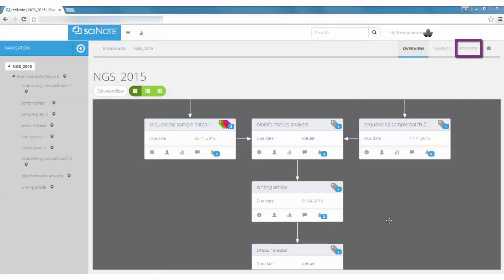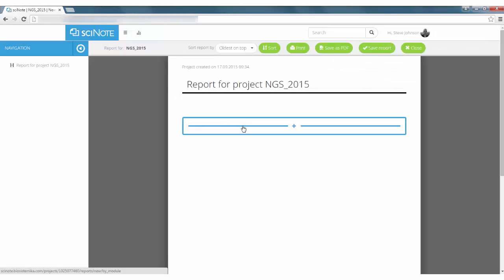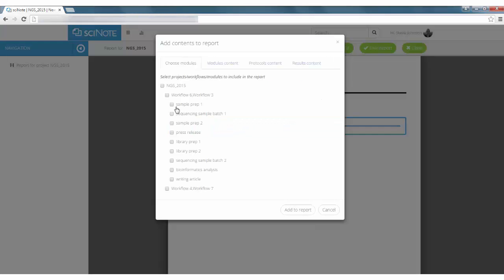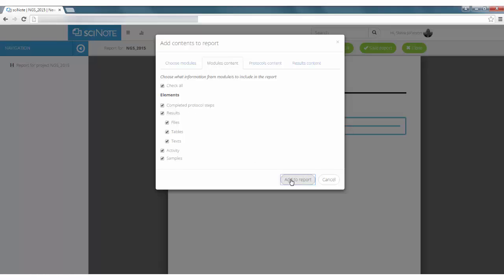Reporting is another unique feature of SciNote. Create a report by selecting the desired experiment. Select data that you want to include and the report will be generated automatically.